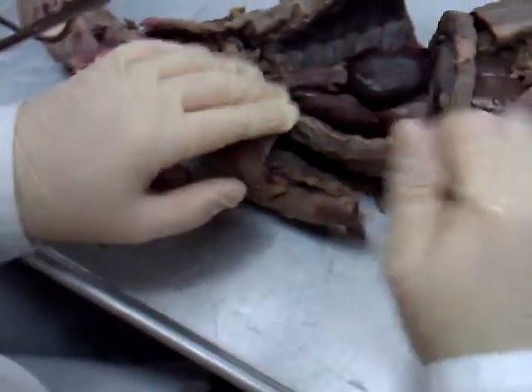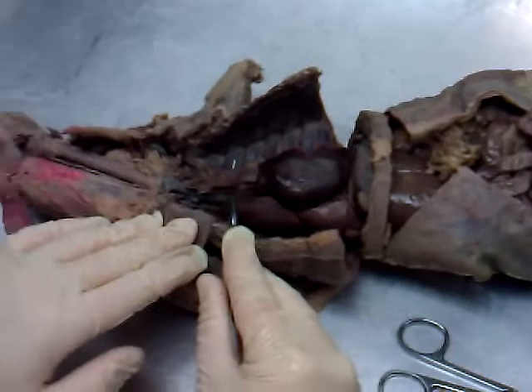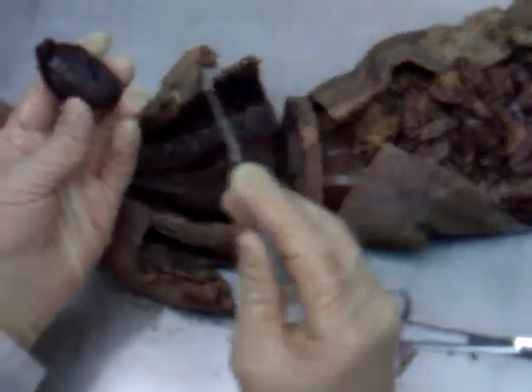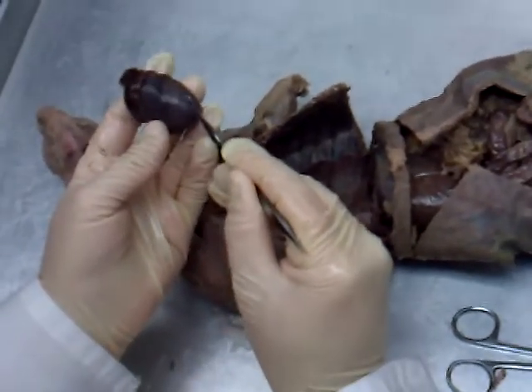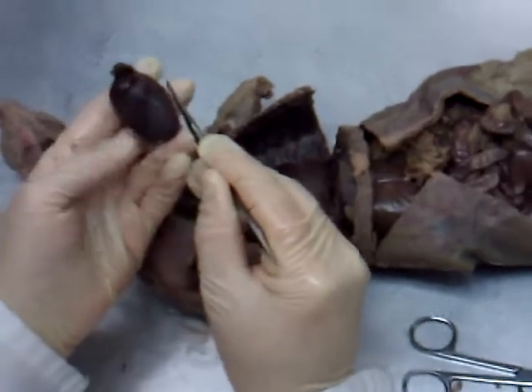Now down into the mink's thoracic cavity. This organ right in here, nice and brown — this is the thymus. Pull that out of the way. Of course, you have the heart right here in the very center. On the heart itself, our chambers: the right atrium, right ventricle, left ventricle, and left atrium on the back side.